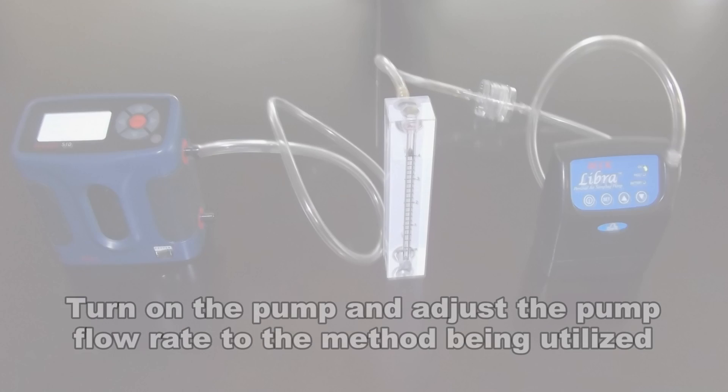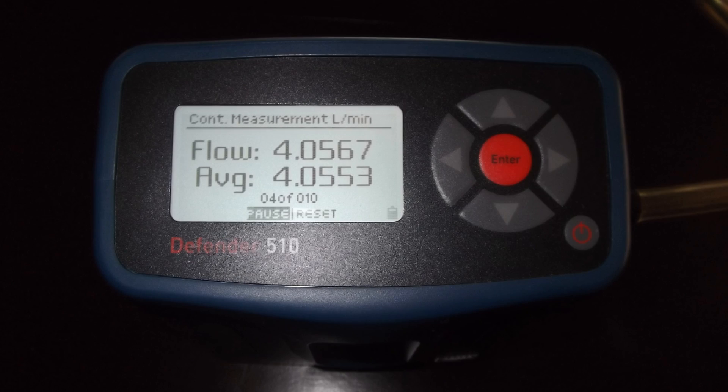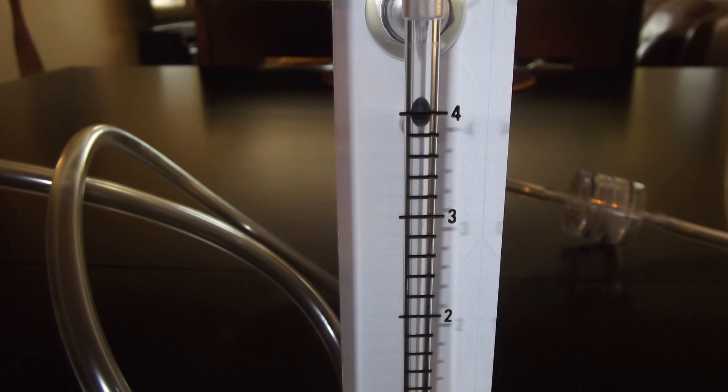Turn the sampling pump on. Adjust the pump flow rate to the desired flow of the sampling method being utilized, verifying the flow rate on the primary calibrator. Rotometer accuracy can also be verified in this calibration train.